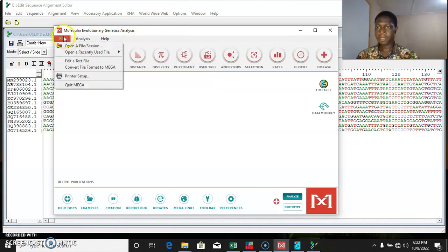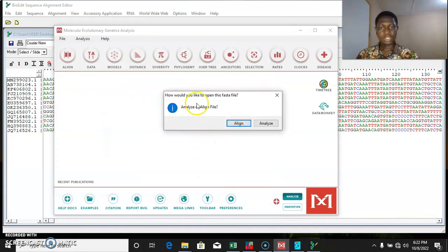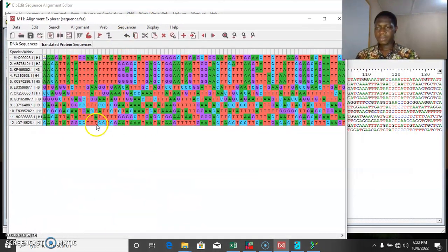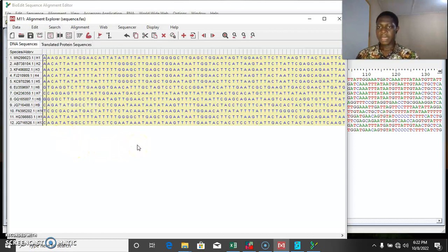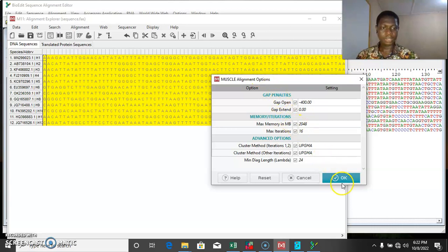So we come to File, open the file, then we select the sequence which is our file name. It will bring this option — align all and align. We select Align. So while we have these sequences imported into the MEGA platform, the next thing we'll do is select all. We'll come to the Edit option, then select all. We are going to be using a MUSCLE algorithm to run the multiple sequence alignment. So we select MUSCLE and align our sequences. We press OK.